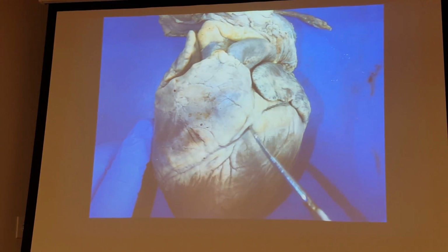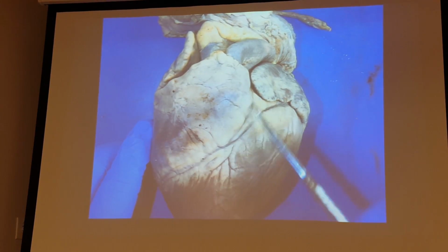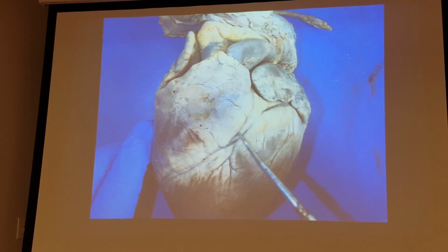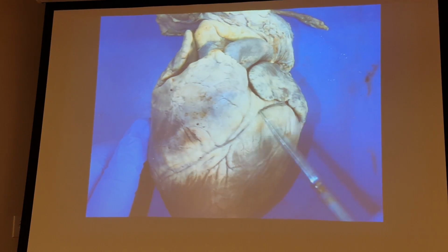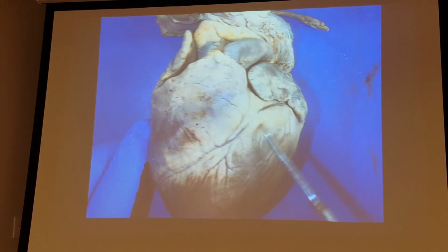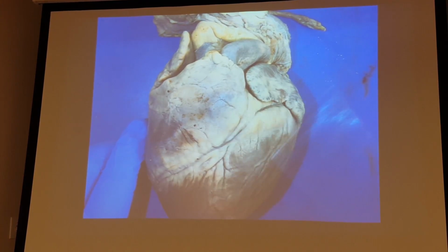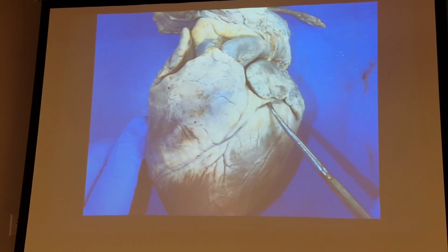And so here is where the left coronary artery, which would start kind of up here, would branch out, and here's the anterior interventricular artery. The circumflex would go back this way, and then we could talk about the great cardiac vein, which would be right around in this area. Now there's so much fat, I'm not going to take a razor blade and shave the fat off. So we're just going to say that those vessels are right here in this area.